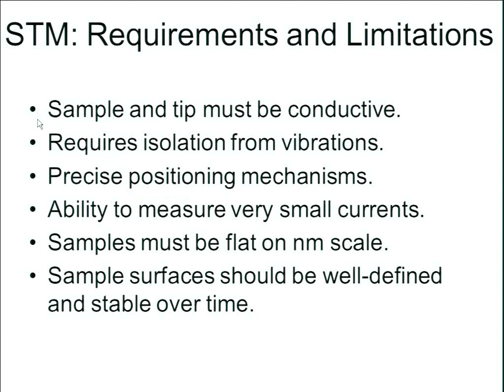So in an STM, the sample and tip must both be conductive. That's quite limiting. It requires isolation from vibration, along with many other characterization tools. It requires precise positioning mechanisms, such as the piezoelectric below.